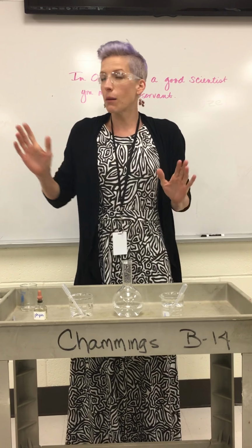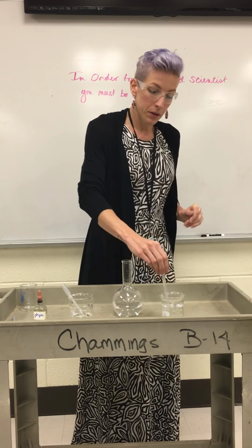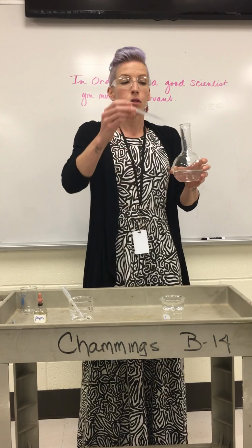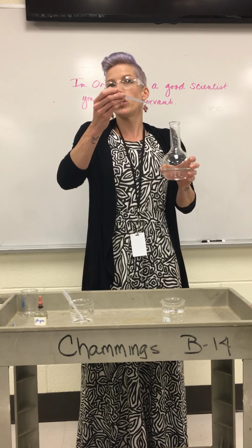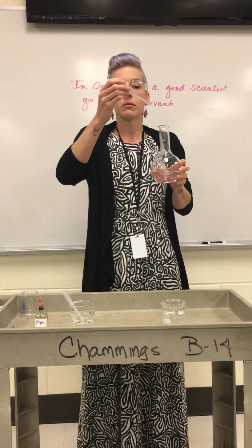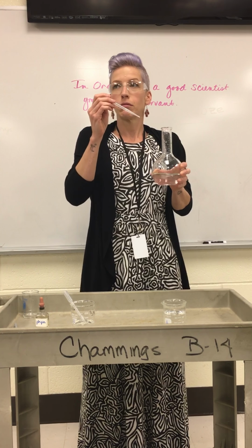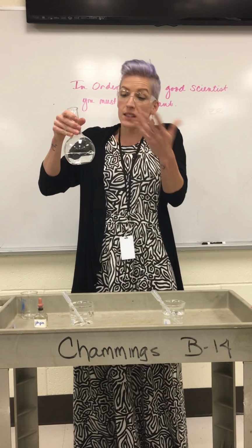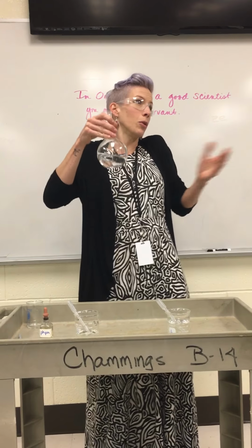So let me start it out. I'm gonna put A into our stock. So clear liquid into clear liquid. What is your hypothesis is going to happen? It stays clear, right? Everybody cool with that? Clear into clear makes sense. It seems like it's water, right? Water into water is clear.